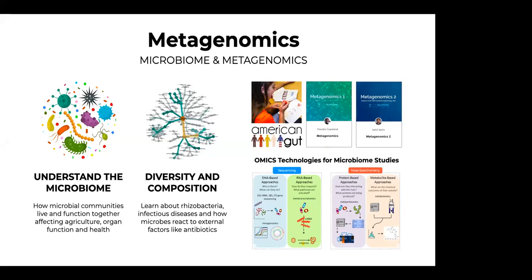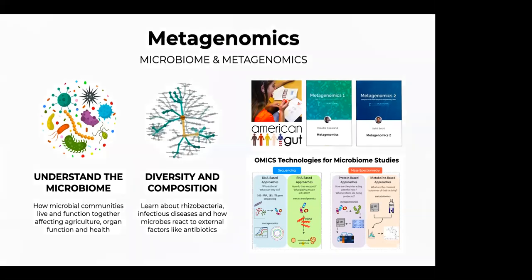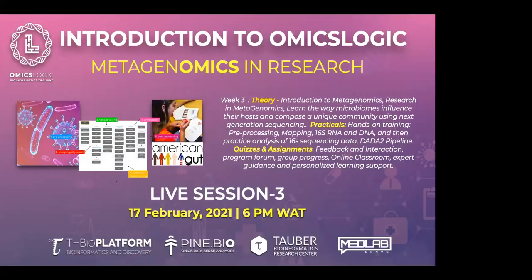To learn about metagenomics, we will discuss what the microbiome is, how we can use next generation sequencing to study whole microbial communities and analyze individual microbial genomes. We will also discuss data sets that are available for studying what role microbes play in agriculture, what role microbes play in biomedical research, and in epidemiological studies of infectious diseases. So microbes have a lot of application in today's world. And in this session, we will be learning about microbiome composition and taxonomy.